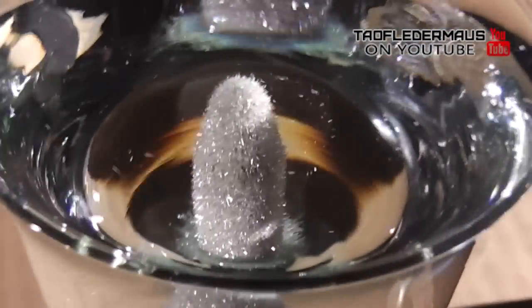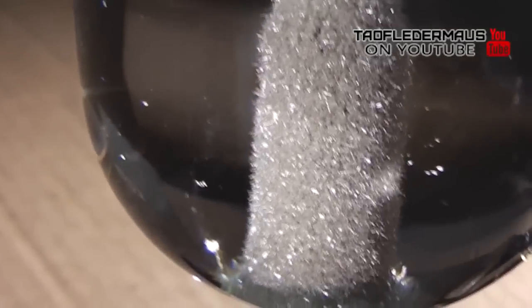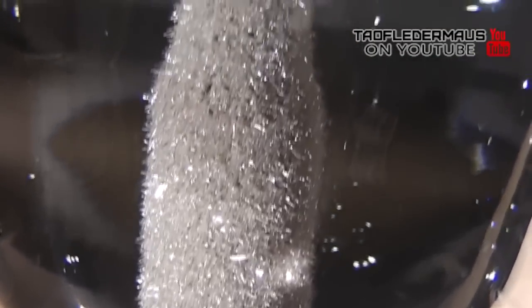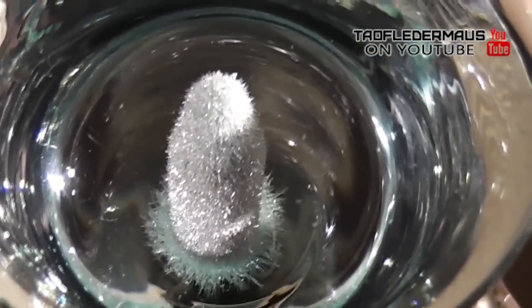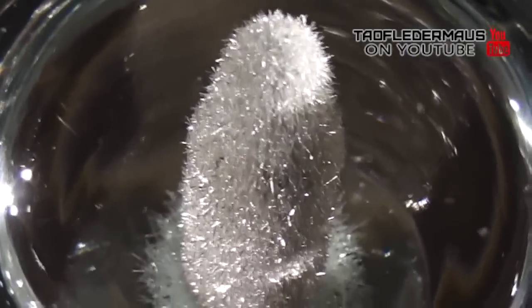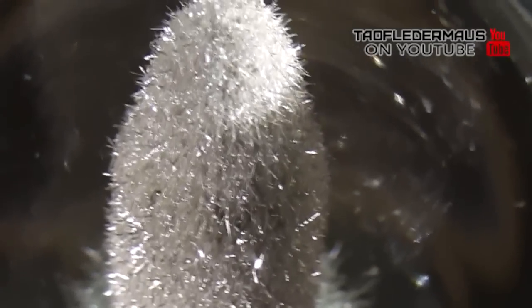The silver crystals that have formed on this rifle round are very fragile. I'll move the camera around just to show you how shimmery and pretty this looks. You can see it's a lot bigger in diameter than it originally was when we put that cartridge in the solution. We could throw some sunglasses on it and a hat and call it Cousin It — that weird furry thing from the Addams Family.